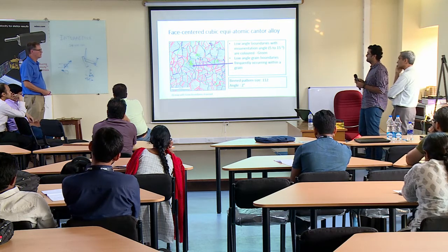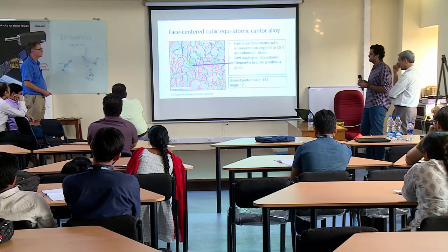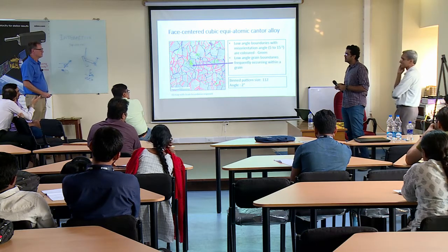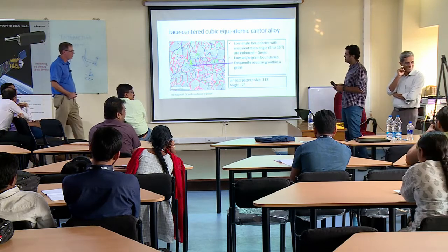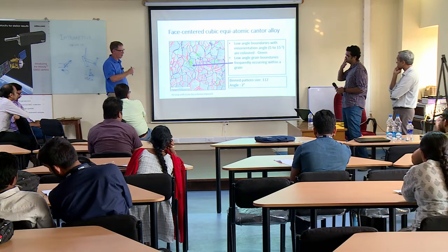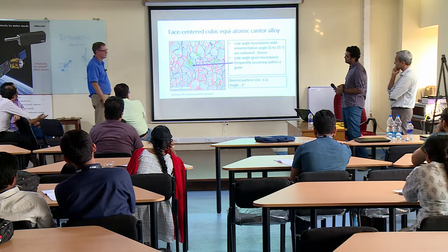You know, I don't know if it's, I assume you're doing standard background correction, just a static one. Do you have any scratches on your phosphor screen? Okay. That shouldn't cause localized problems, but it could, because in some grains, that scratch could lead to a misidentified band.